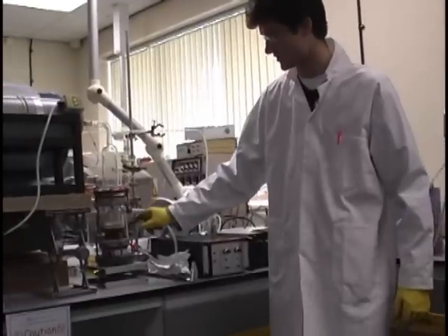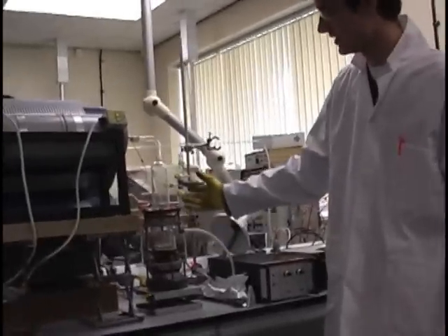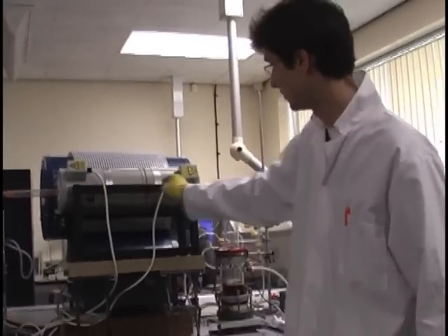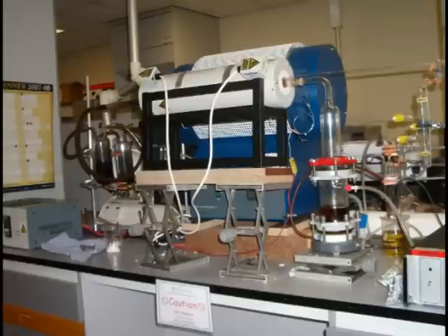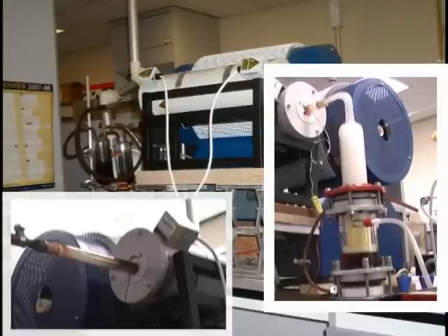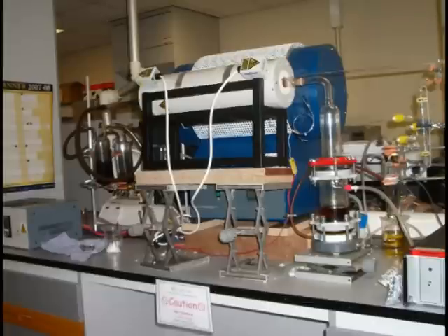A non-reactive gas is passed through the heated solution of the hydrocarbon. The mixture passes through the furnace where the temperature can be from 300 up to 1150 degrees C. He can run the experiment for as little as five minutes up to hours in order to get longer tubes.